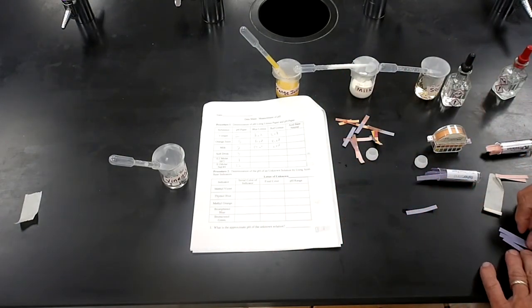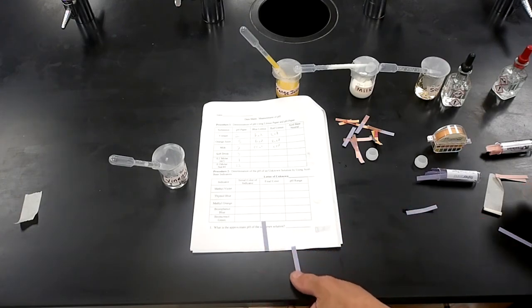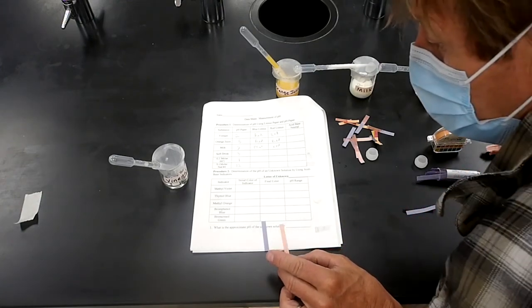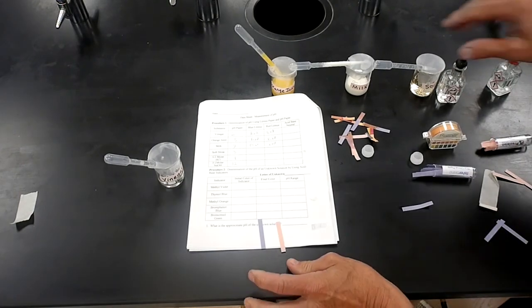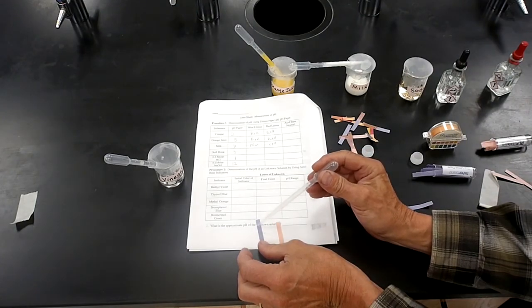Now we'll go with the soft drink. Whoops, here's one red, one blue. Alrighty, soft drink. Blue litmus paper.